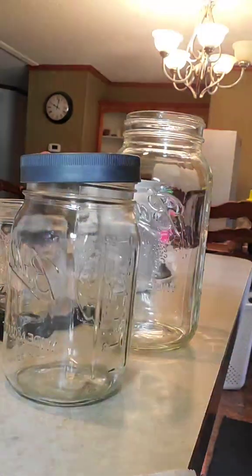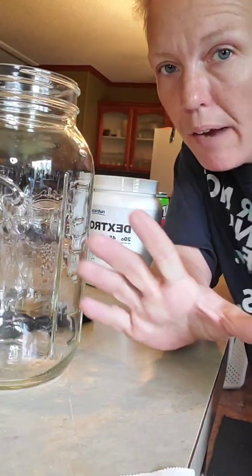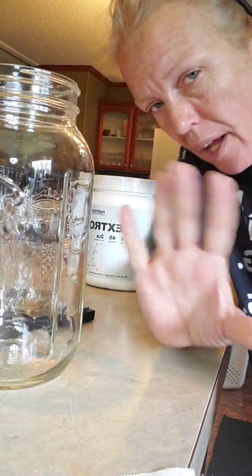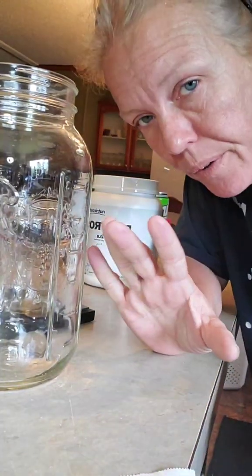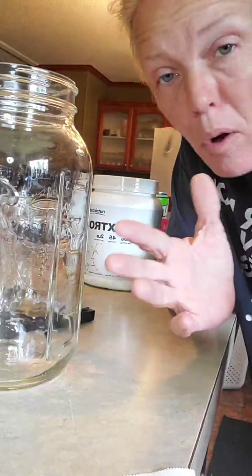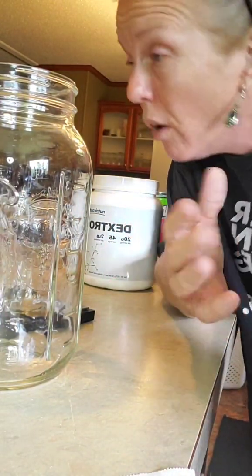This is not a procedure, guys, by the way, that you need gloves, sterilization, everything like that. At the point it comes out of the pressure cooker is when you need to start practicing sterile tech. All of this stuff right now, you can't be sterile. You could in a perfect world if you had Paul Stamets' lab. I'm working from home, y'all.